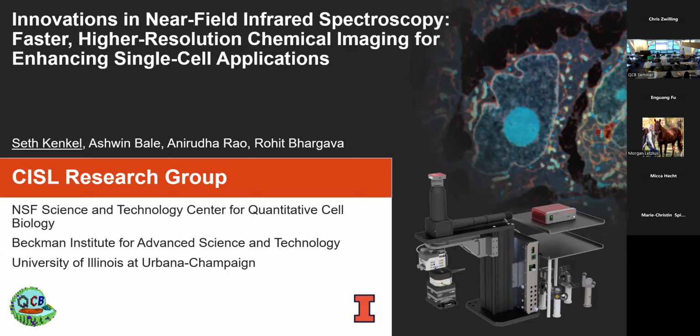So in this case, it's really convenient because this epoxy has a band at 1732 where the cells don't. But a different resin has a slightly different spectrum, which is not at 1732. So in that regard, segmenting out cells could be slightly tricky, but in terms of performance, it's much better. We just haven't done it yet because it requires an instrument which ITG owns, but it's currently broken. Story of our lives, right? Yeah. That's fine.